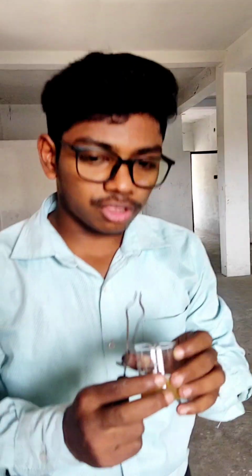And this is because copper, which is less reactive than ferrous, doesn't displace the ferrous in ferrous sulphate solution, so it has no reaction.